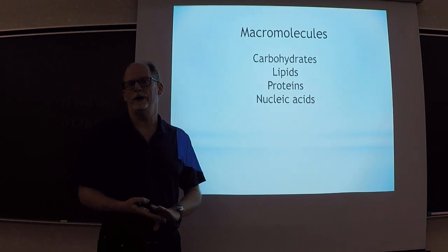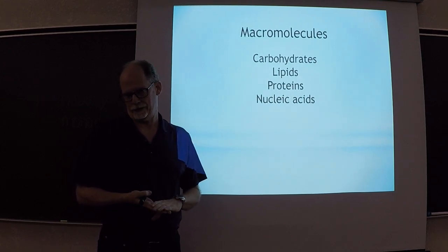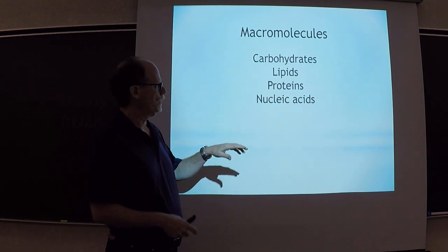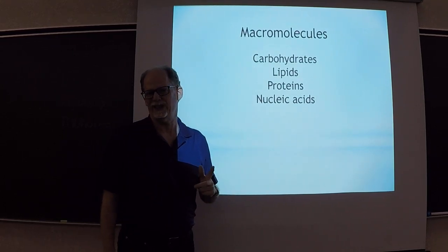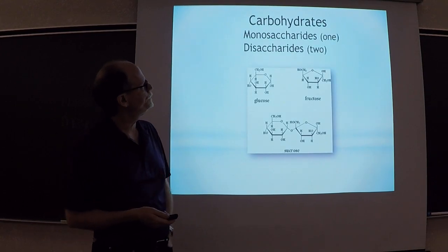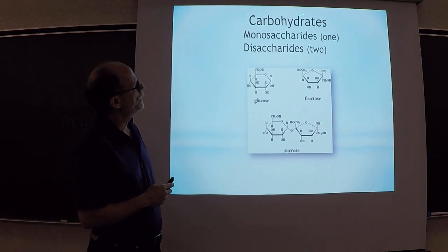So you're going to need to know the names of those tests, what those tests test for, what a positive result looks like when you take the practical. I might ask you specific questions about proteins and carbohydrates on the quiz, and I'll go over that material. So we talked about this in class as well.